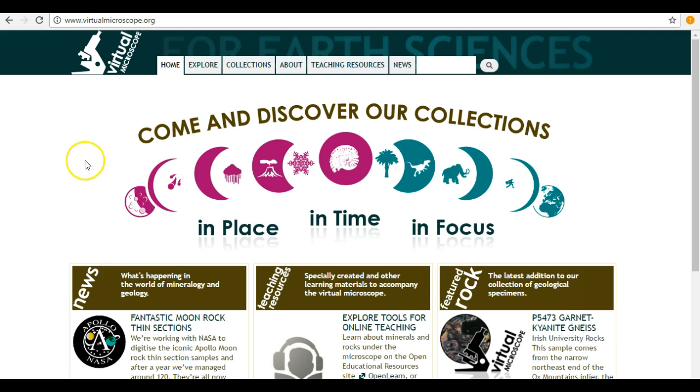This GLab video has been created to enhance the utilization of the virtual microscope for teaching and learning. You should now be able to successfully search, explore and navigate the Virtual Microscope webpage and view the various geological samples without the use of a physical microscope. That concludes the introduction video of the Open University Virtual Microscope.